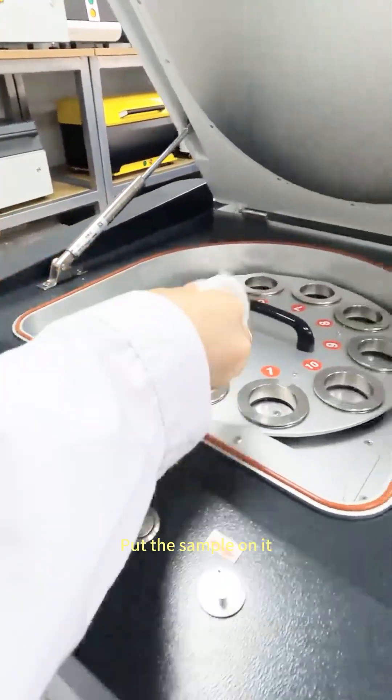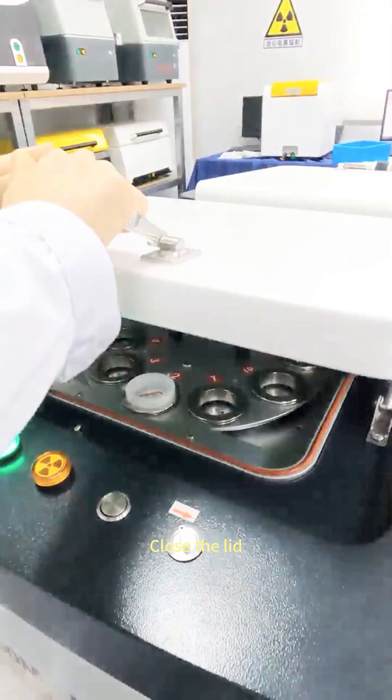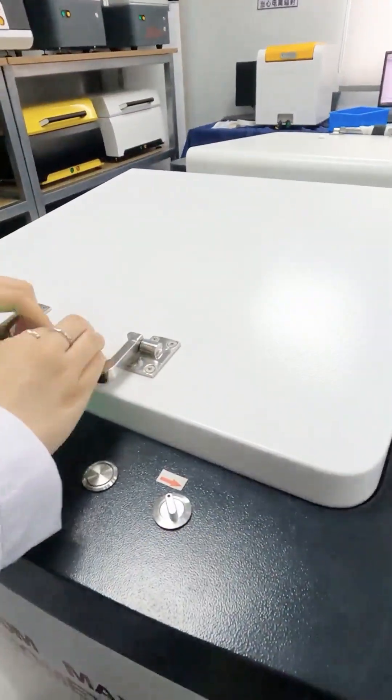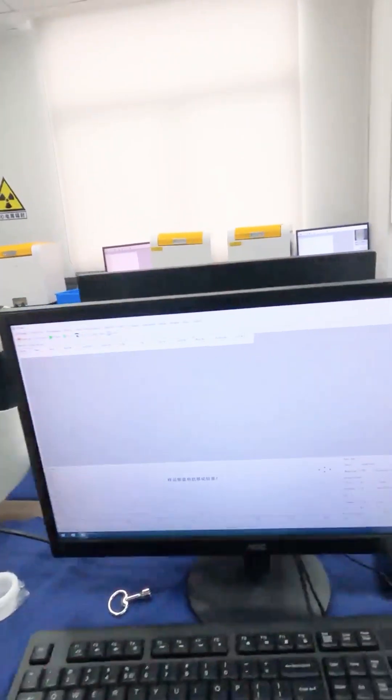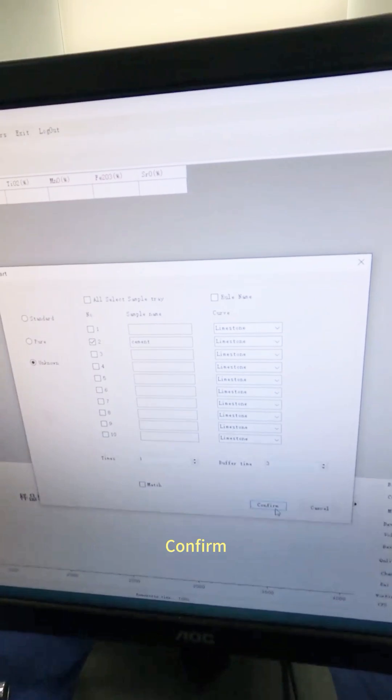Put the sample on it, close the lid, click the start, confirm.